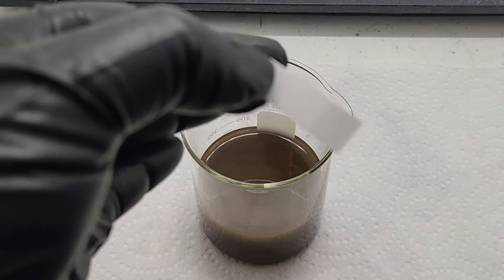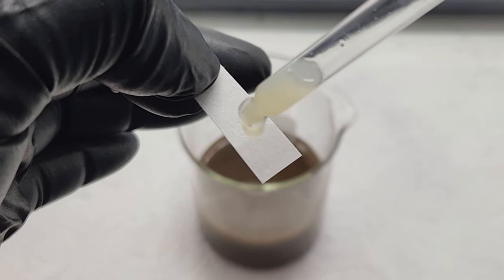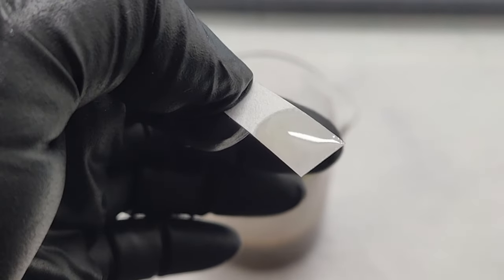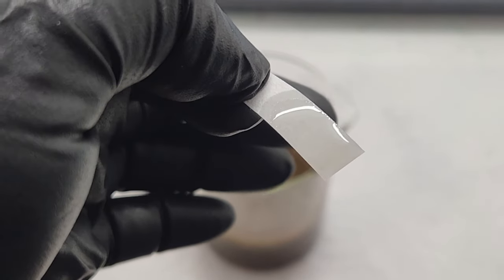We perform another stannous chloride test. The lack of a stain confirms that our gold has precipitated out of solution completely. Having previously confirmed that our stannous chloride testing solution was functioning properly, we can feel confident about this test result.